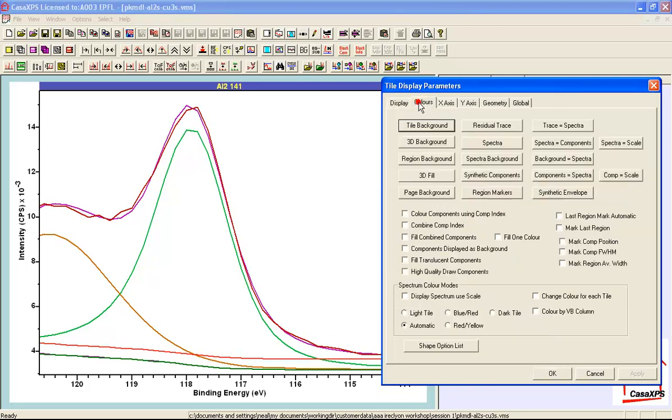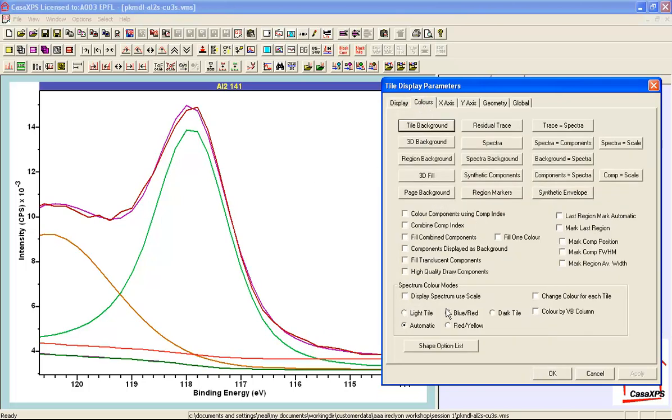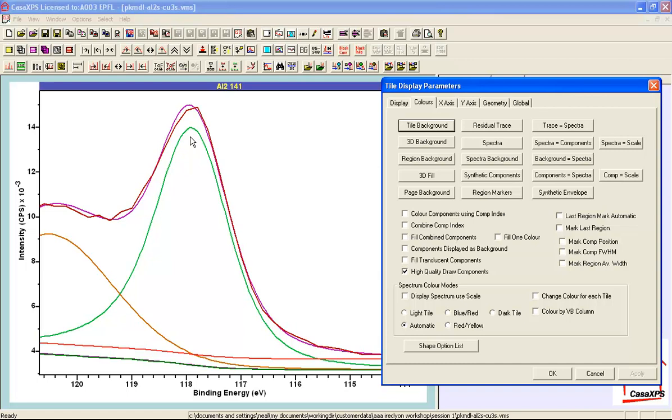We can do this using the colors property page and there's a tick box that says high quality draw components. So when we tick this and press apply we now see the components are drawn with a smaller step size in energy and therefore we see a smoother curve.